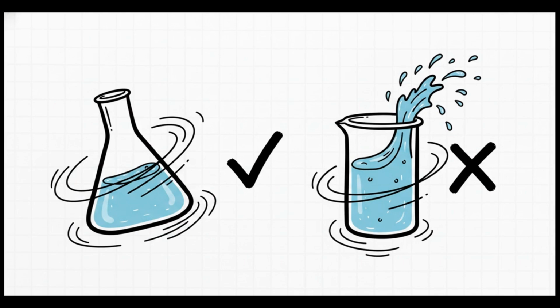And finally, part E. Why on earth do we use a conical flask instead of just a beaker? Well, the slanted sides of a conical flask make it dramatically easier to swirl the solution vigorously without spilling any of it. If you lose even a little bit of solution during mixing, your entire calculation becomes inaccurate. It's a simple, practical technique that translates directly into a free exam point.